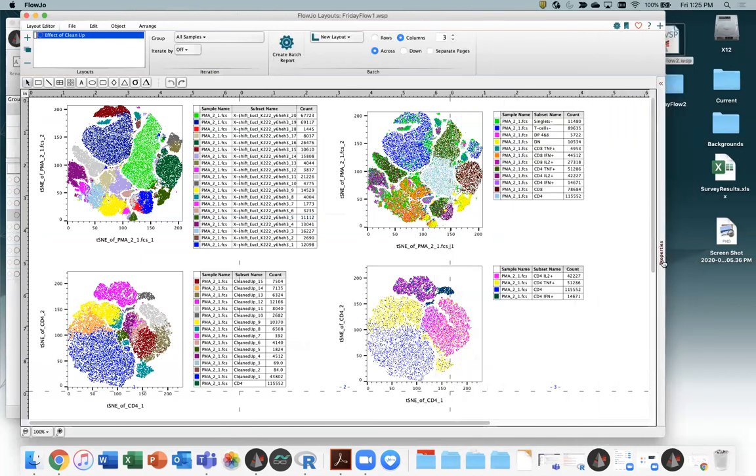If we had just started at the top and said, tell me what's in this data, you get a whole bunch of clusters. And so here's the clustering. Each one of the different colors is a Phenograph, sorry, an X-shift cluster, and it's being shown on a t-SNE plot. And what we see is that this looks reasonable, in my opinion.